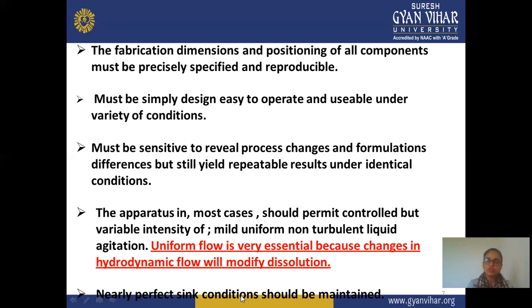Sink condition means you remove some buffer solution from the particular buffer, and you add fresh buffer solution to your sample. So this condition is also known as sink condition. You should maintain the sink condition for appropriate results. When you maintain the sink condition, it gives good results and less error or variation is observed in your formulation.